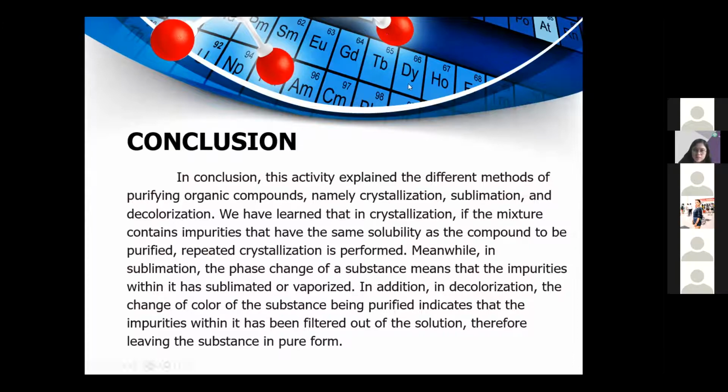crystal clear, or clear, with just water as the outcome after the activated charcoal was added. So the activated charcoal decolorizes the solution, making it pure form. So that's all for experiment 5.